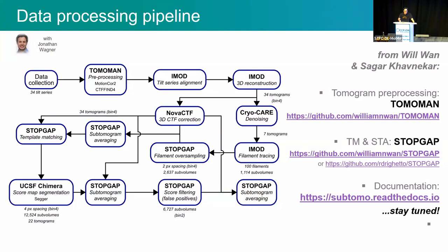These things are open source and they are available on GitHub, but they are not very well documented yet, but we are working on it. And Sagar and Will are planning to release these tools sometime later this year with a publication and documentation. And I have also done some customizations to the STOPGAP code that we are now merging back into the main code and writing some tutorials. So stay tuned for updates on this front later this year.